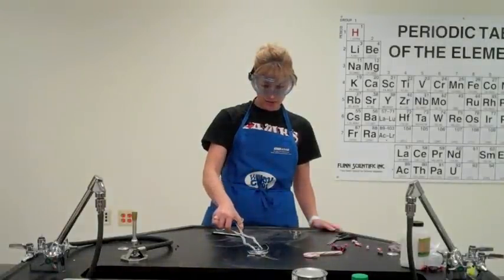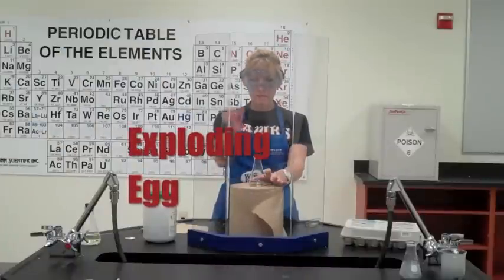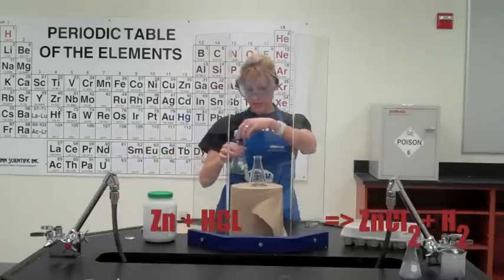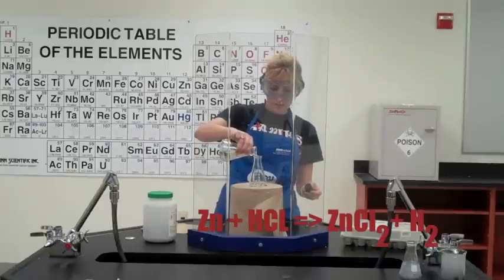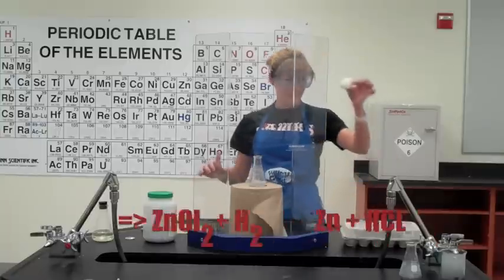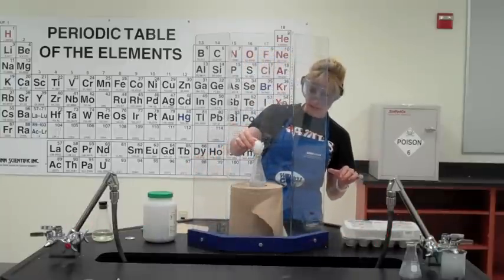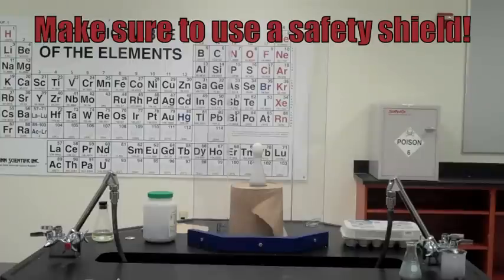What we have left over is the very fragile, brittle solid of magnesium oxide. For this one, we have a couple pieces of zinc and I'm going to pour some hydrochloric acid over it. This one is called Exploding Egg. Zinc and hydrochloric acid don't really have a lot to do with an exploding egg, but the hydrogen gas that's produced will fill up this little blown-out egg that we put over the top of the reaction. And those of you who have taken chemistry know that hydrogen gas is quite flammable.